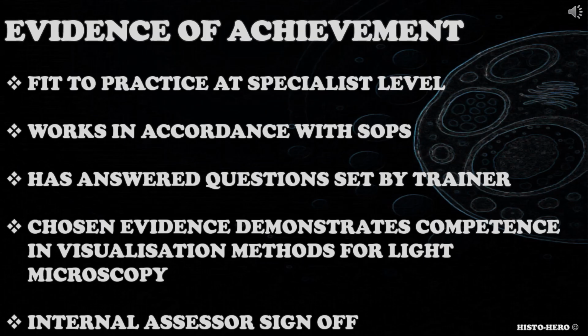The candidate will need to be signed off as competent by an internal assessor for each subsection. They can be signed off by you, the training officer, the senior BMS overseeing the relevant section, or by the training lead.